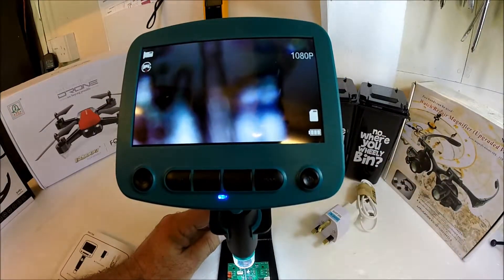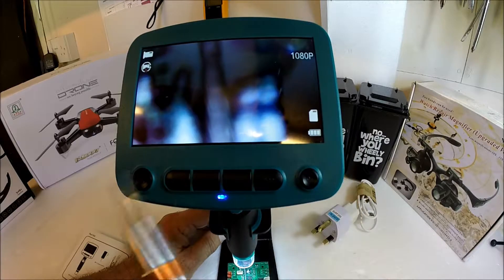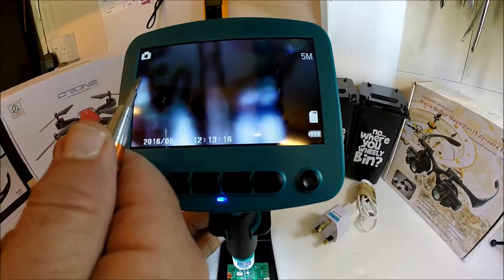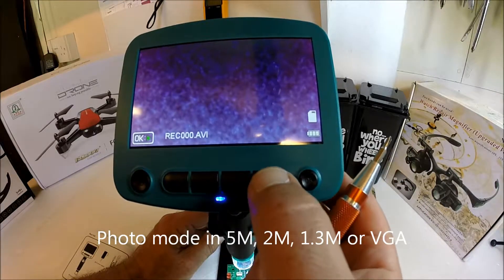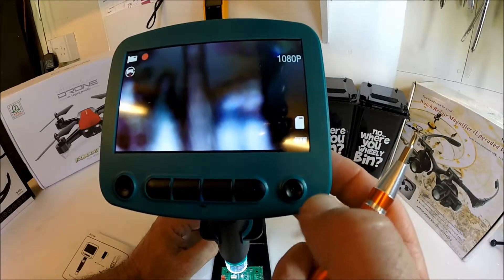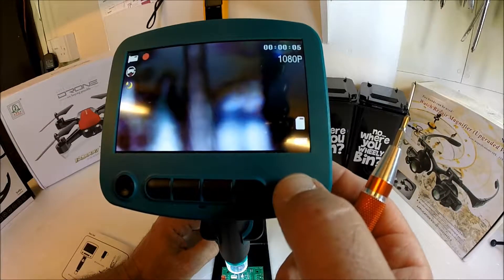We have two recording functions with this. At the moment it's set up to record video onto microSD. If you change the mode, you can also take a photograph, which again will record to microSD. In order to take a video, you just press the button there. You can see it's flashing, indicating that it's recording video.